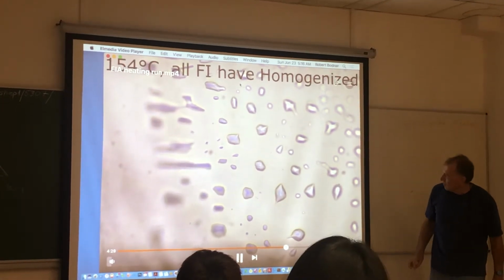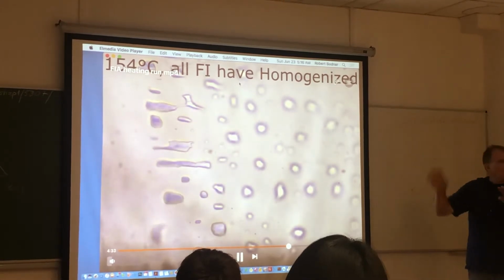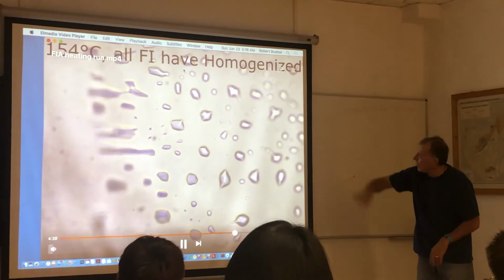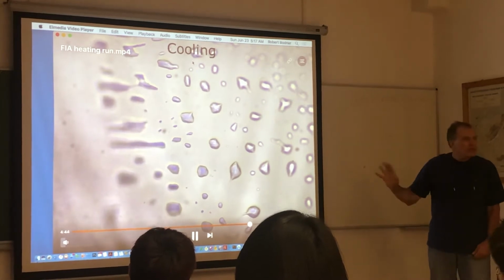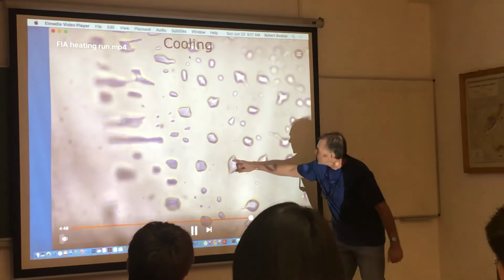And then we're holding temperature. Now he's holding the temperature constant, and he's focusing up and down just to see that all the inclusions have homogenized, and they have, at 154 degrees. Now he's going to cool it just enough to nucleate the bubbles, just enough to get the bubbles back. So there's that bubble back.